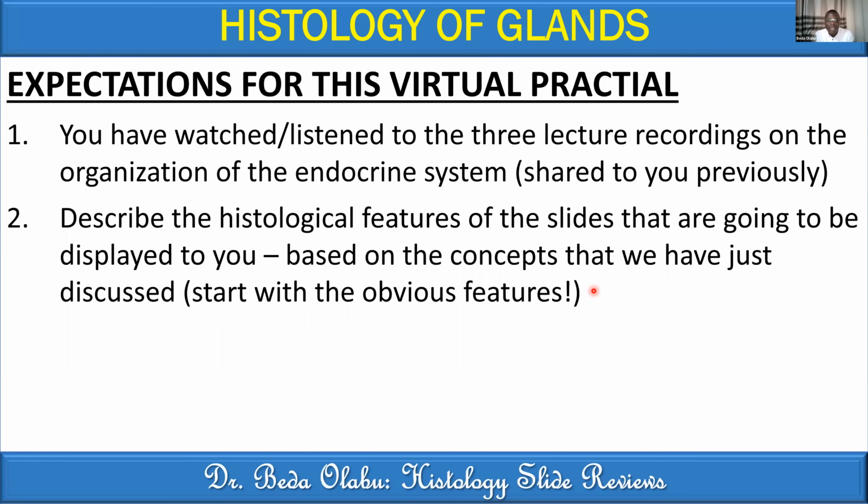Now, when you are describing histological slides for the purpose of identification, it is good practice to start with the obvious features. So you don't have to describe them in the order in which I gave you the features to look at. No, I don't want you to restrict yourself on that one. But I want you to start with the big picture. When you're given a slide, what is shouting at you? What is looking at you?